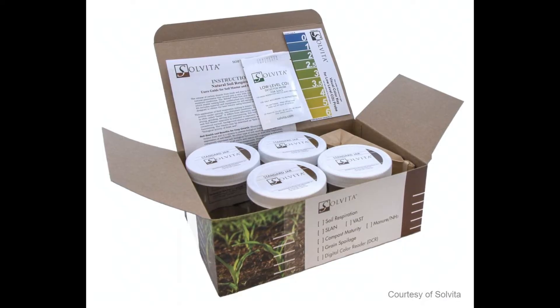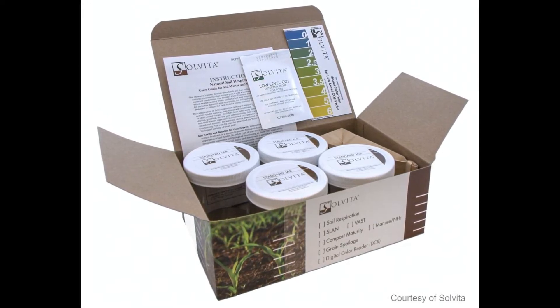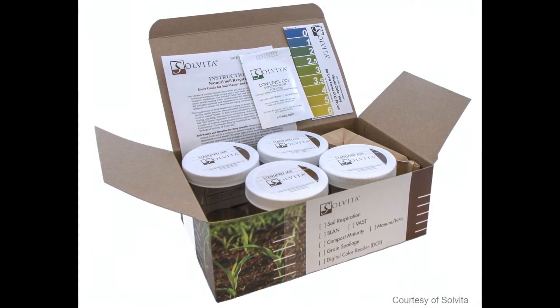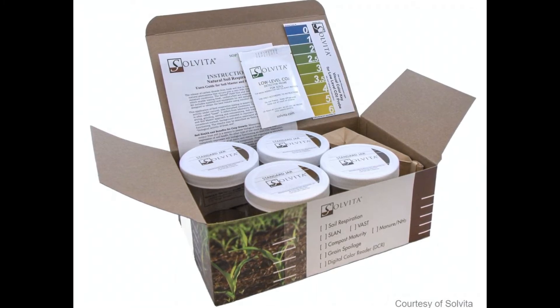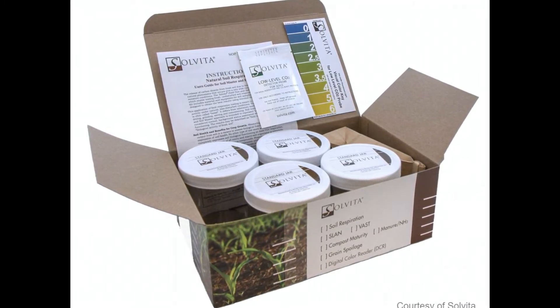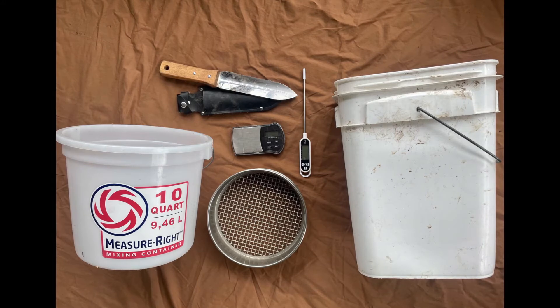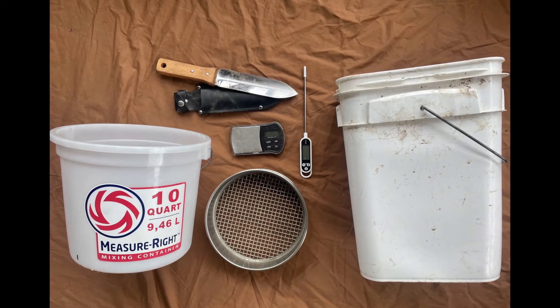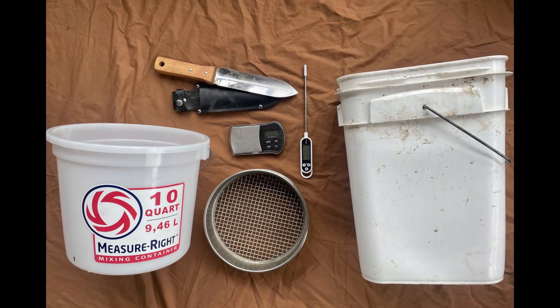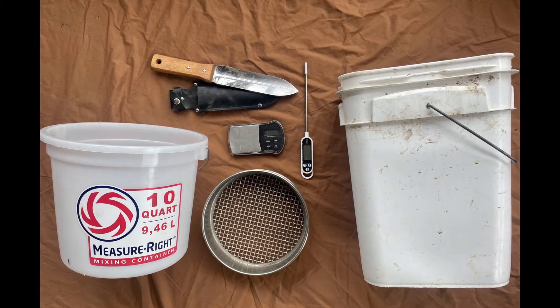To perform this test, you'll need a Solvita Basic CO2 test, which can be purchased from Solvita.com for about $99. The Solvita field kit includes jars, testing probes contained in foil packages, a color chart for interpreting results, and an instruction manual. You'll also need a soil knife or trowel to collect soil, a small bucket or container, a sieve to remove debris from the soil, a container to place the soil in once it's been sieved, a soil or meat thermometer, and a kitchen scale.